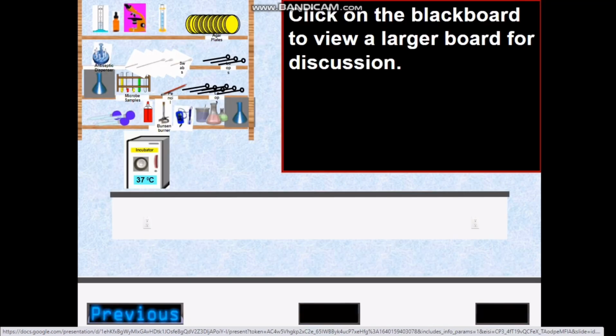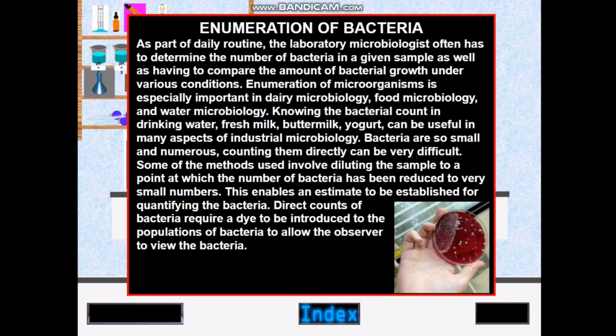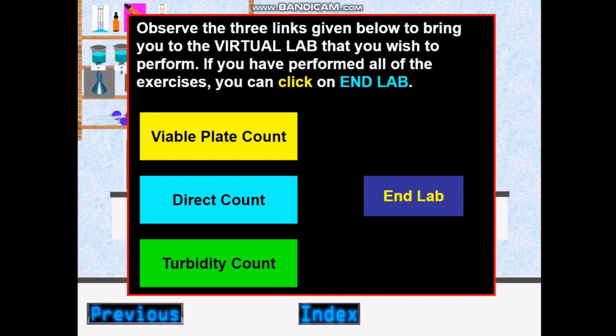So now I'm going to do a bacteria enumeration lab simulation. Firstly, we will click on the blackboard to view a large board for discussion. So here we will read through it. We will do a viable plate count.